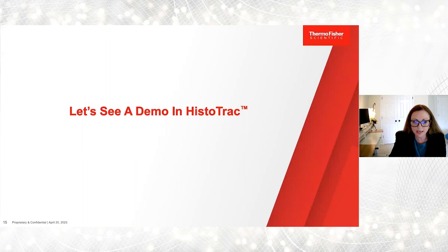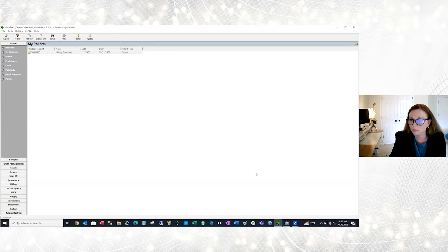So let's go ahead and take a look here and get into the software. So this is HistoTrac.